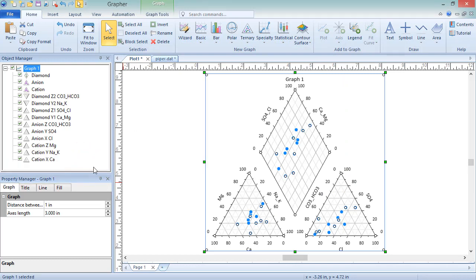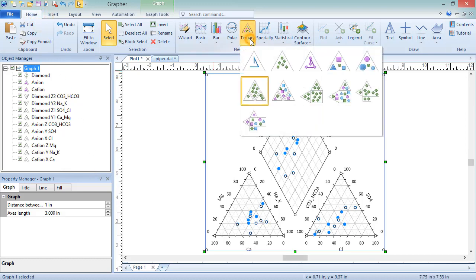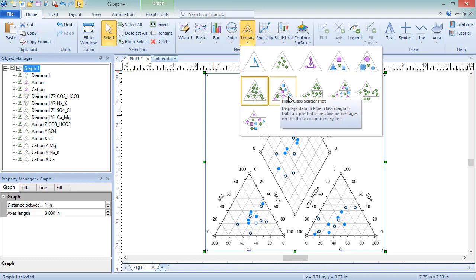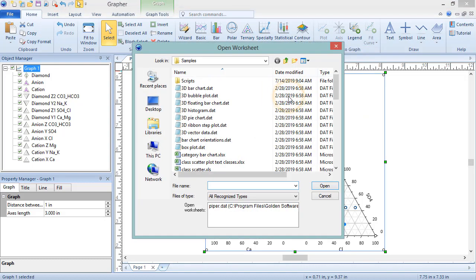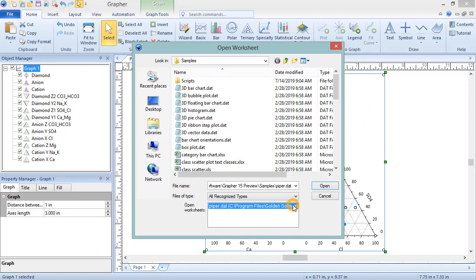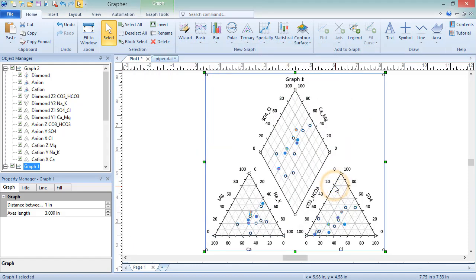To create a Piper class scatter plot, click Home, New Graph, Ternary, Piper Class Scatter Plot. In the Open Worksheet dialog, select a new or opened data file and click Open. The plot is created.